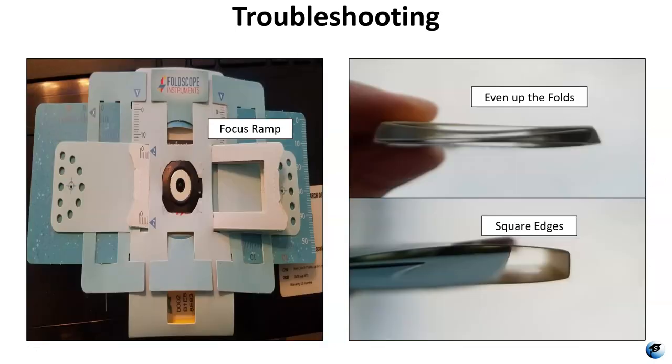One more issue I was having was with the focus ramp. The focus ramp is the piece that goes just behind the lens — it's really thin on one side and thicker on the other, and it moves the lens closer or further away from the slide to focus it. I took mine out after assembly and found the folds were rounded out and not lining up properly. I unfolded it, re-creased all the little folds, and put it back together, making the edges much more square. The cross-section went from uneven and smashed-looking to nicely squared off.